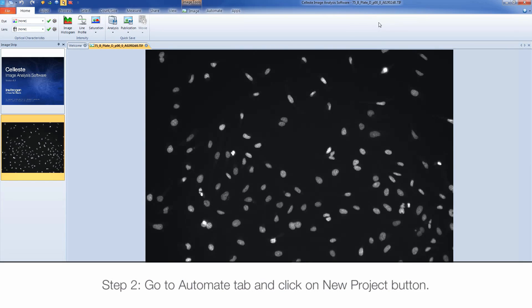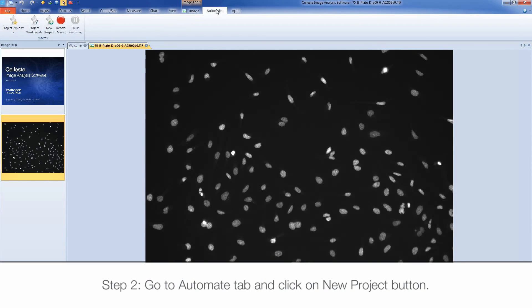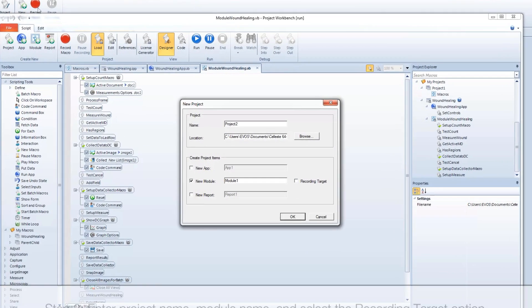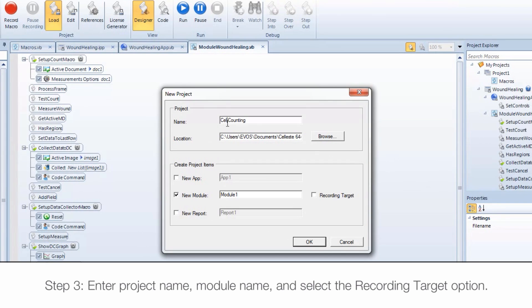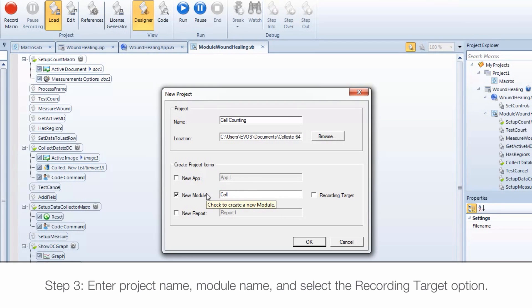Go to the Automate tab and click on the New Project button. Enter a project name and module name and select the option Recording target. This will activate this module as the active module when setting up a recording for a macro.